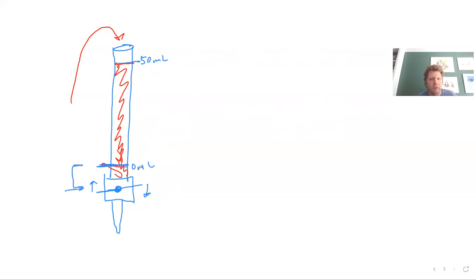What you'll notice about a Buret is there's this valve right here, and then there's this void basically. So below that 0 milliliter marker and where that valve is, there is a volume. So there is some solution that stays in there, some solution volume that you need to account for. Essentially what this means is that a Buret is very, very effective for measuring a solution within the range from here to here.